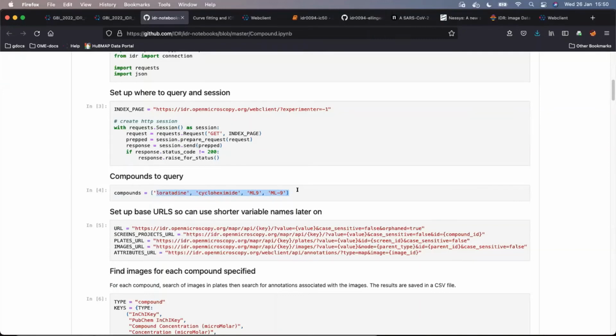So this is basically a search many to many, if you happen to know what that means, meaning that you can have a list of compounds, and then you will be confronted with a list of images which are associated with those compounds across many different studies, as many as are hitting matches for the list you submitted here.